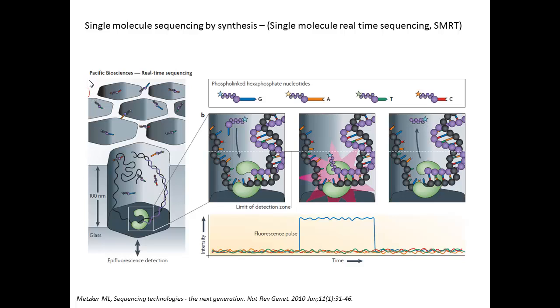Another sequencing method is being promoted by Pacific Biosciences. Their acronym is SMRT sequencing, for single molecule real-time sequencing. Again, we have a sequencing by synthesis type approach, but here we've isolated polymerases, attached them to the surface. And the surface is in the presence of wells, and so you have a pretty significant depth here on a molecular scale. And what we're going to use is epifluorescence, meaning we're going to excite with an evanescent wave, and the light is only going to extend a certain distance into the well here.